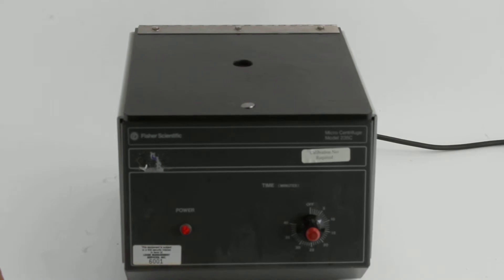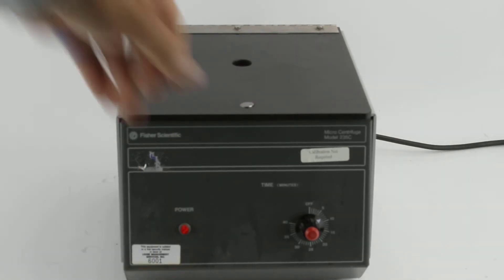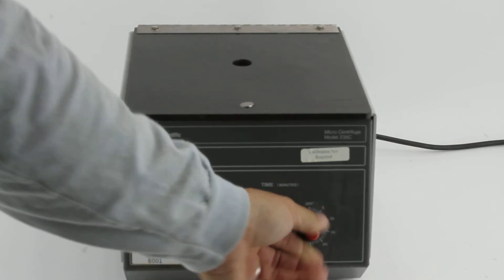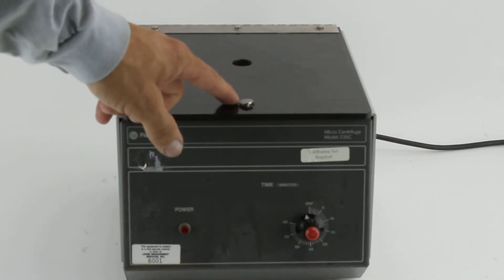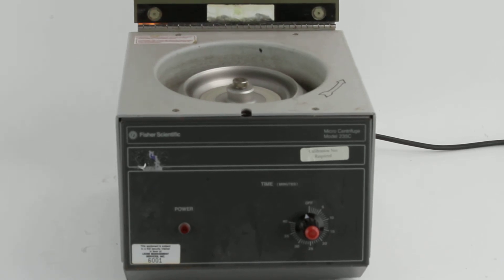Turn it off. Turn the time all the way down. Below a certain RPM the button pops off. You can see it spinning freely in there. It's obviously powering down.